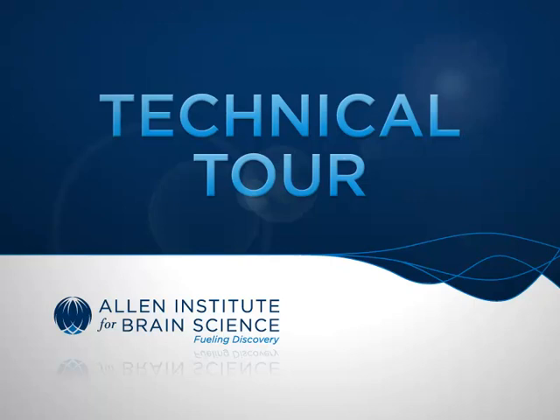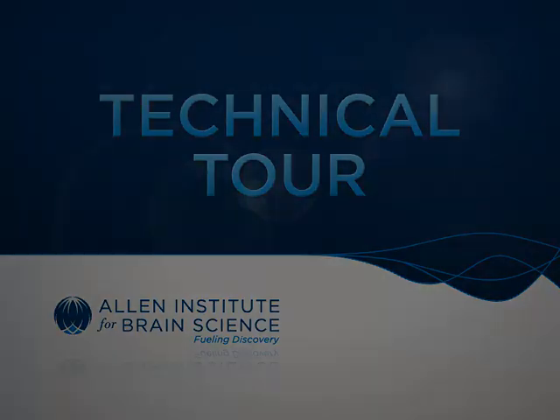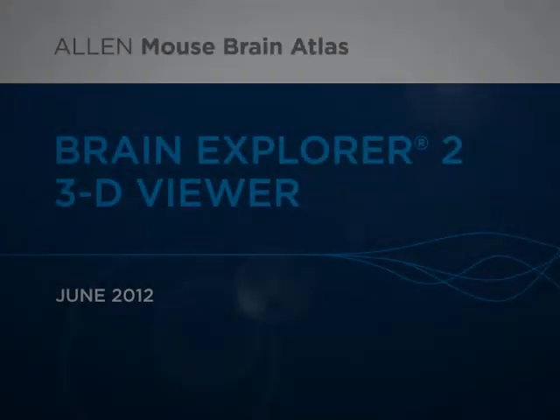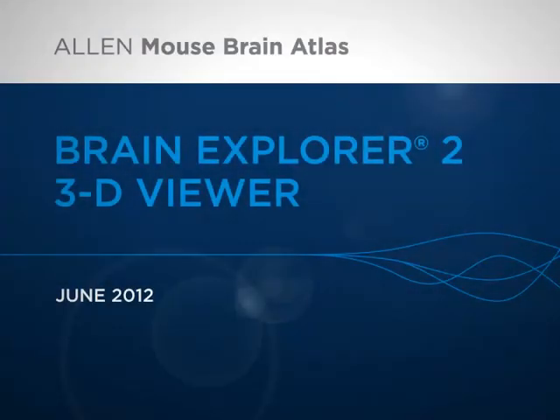Welcome to the Allen Institute for Brain Science Technical Tour. This tutorial will demonstrate the basic features of the Brain Explorer three-dimensional viewer for the mouse brain.